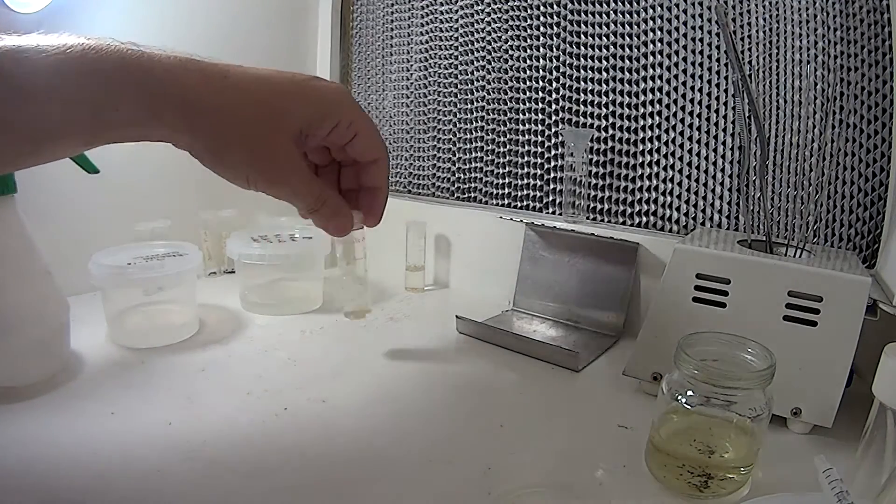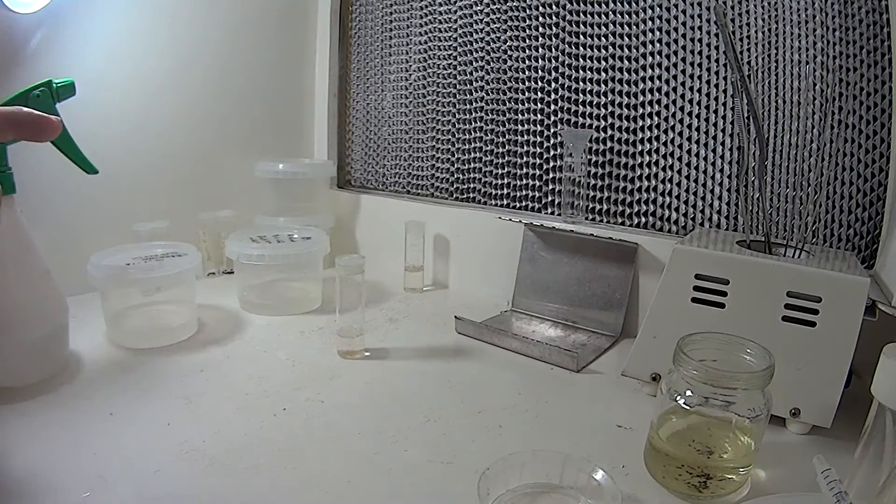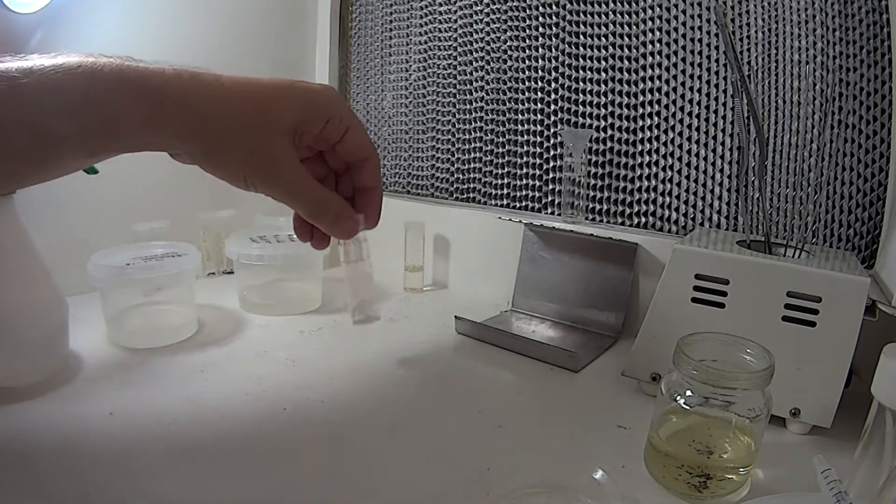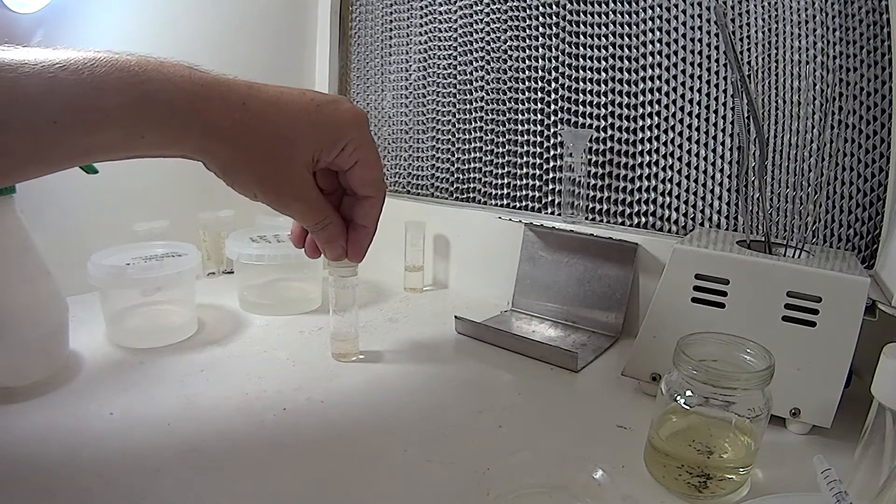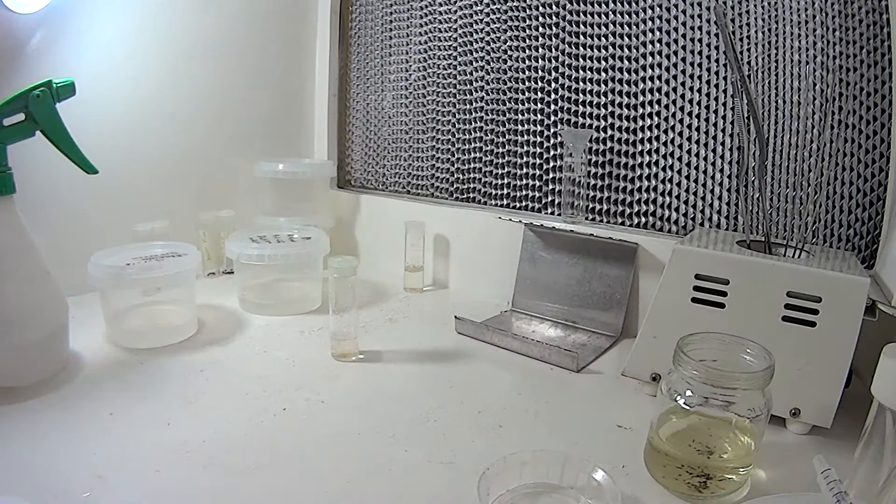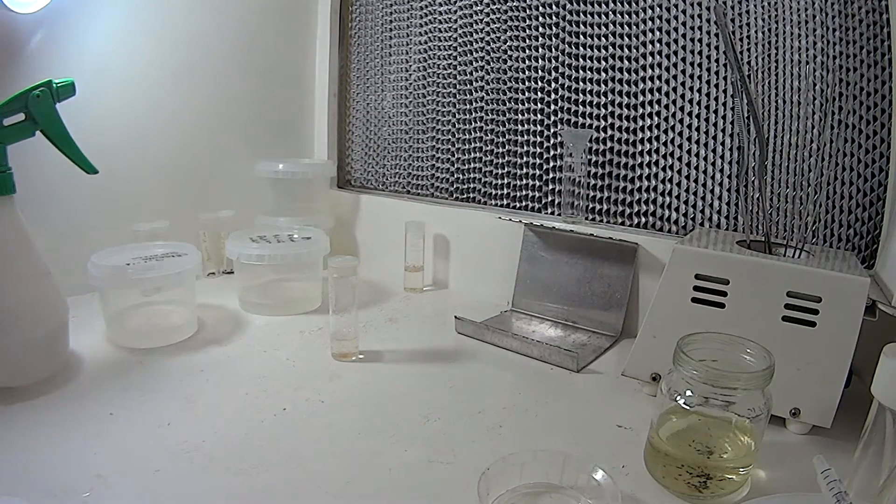But what I've done now is, we've got some orchid seed in plant preservative mixture sterilization solution. That solution is 2 mls of plant preservative mixture with 50 mls of media. There is instructions on how to make this sterilization solution up on one of the other videos.